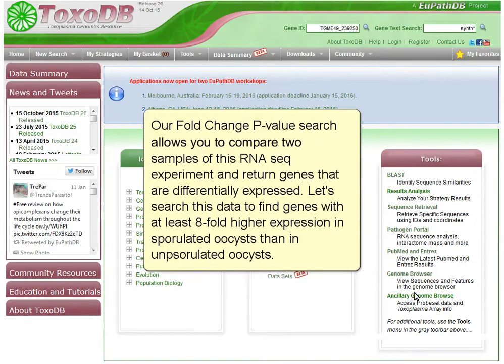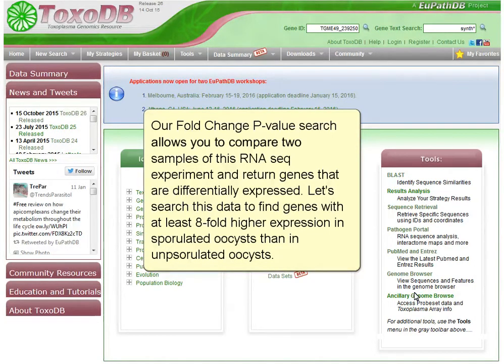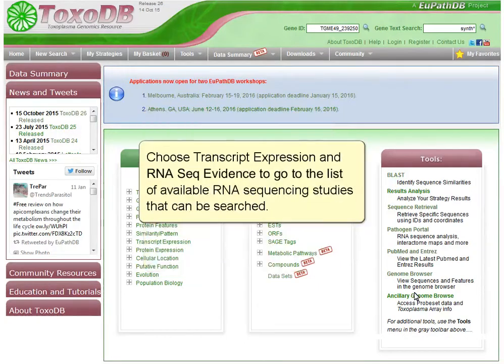Our fold change p-value search allows you to compare two samples of this RNA-seq experiment and return genes that are differentially expressed. Let's search this data to find genes with at least eight-fold higher expression in sporulated oocysts than in unsporulated oocysts.